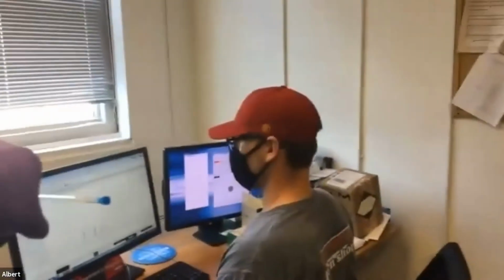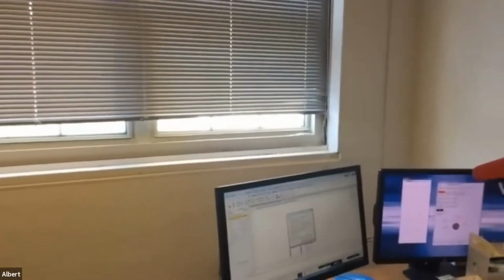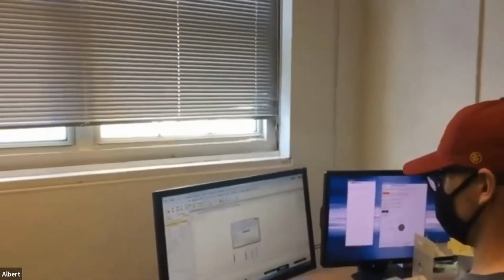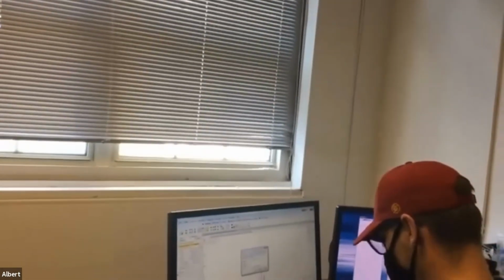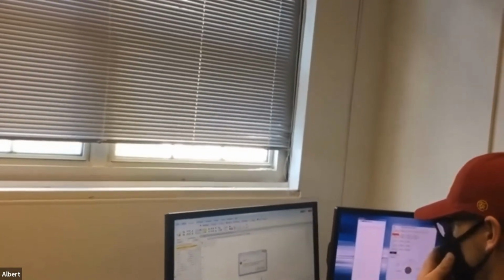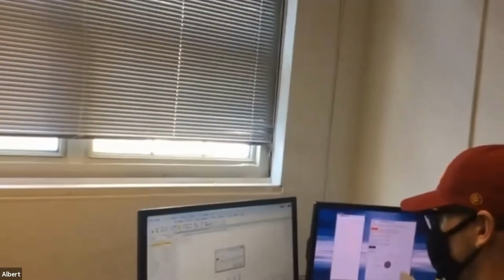So now we're going to do a new file. So let's save that. Yeah, so go to file and then save as. And then click OK. Hold on, go back. Make the R in Russell a capital letter because this is not reading that directory. What does it say? Click cancel and go back.